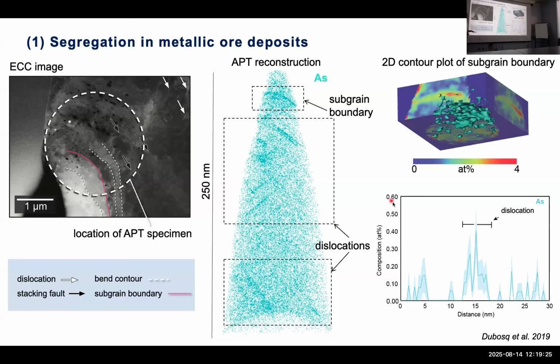Okay. So on either side of the dislocation, we notice a region that is depleted in arsenic. What this suggests is that the arsenic enriched in the dislocation was sourced from the regions adjacent to it. So this points to the dislocation impurity pair model, where arsenic is being attracted to the core of the dislocations.